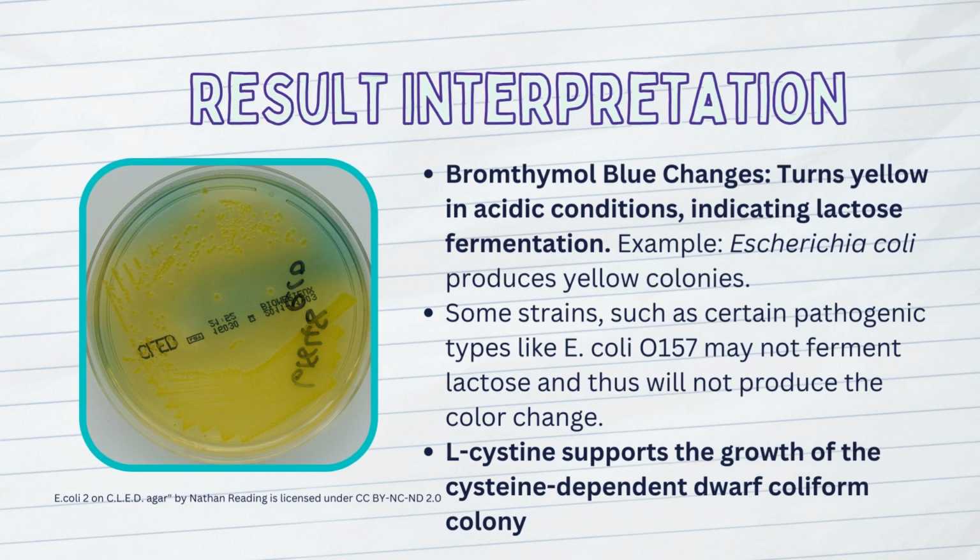So when it comes to result interpretation, every agar has its unique components, and that of course will affect how a bacteria may or may not grow on the agar. With bromothymol blue, when we see yellow colonies, we know that acidic conditions occurred due to lactose fermentation.